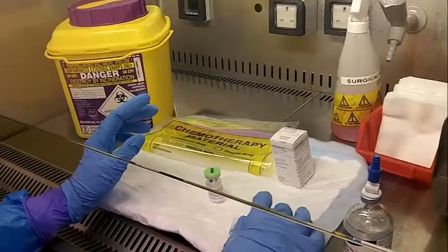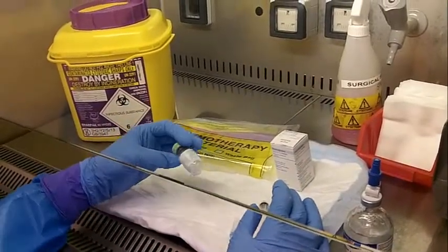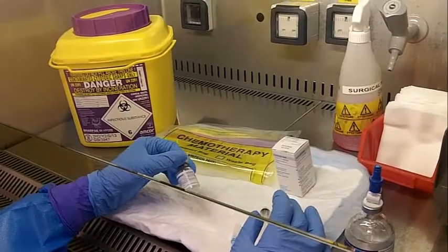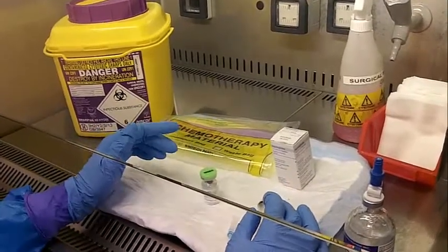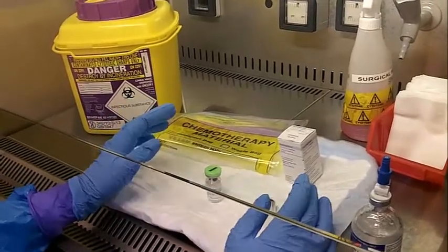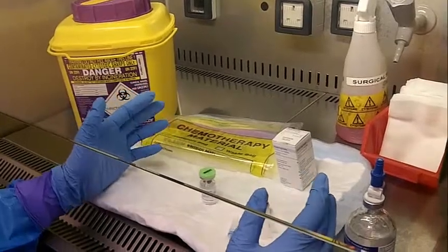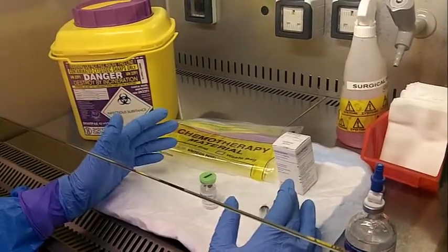So in this video I'm going to show you how we draw or reconstitute powders into solutions when they're cytotoxic. This drug's called asparaginase, and we don't use a closed system when we do this, so this is exactly how you would be doing it out in practice if you were using this item.